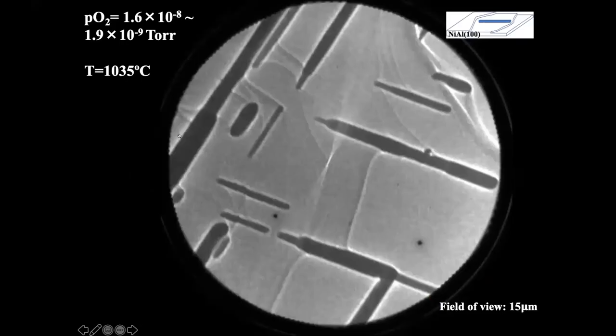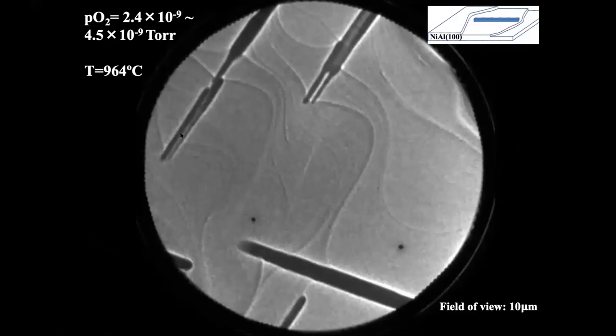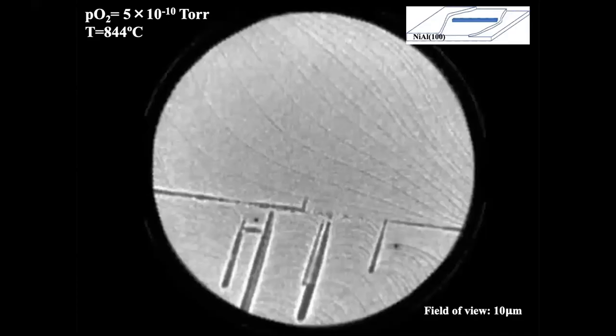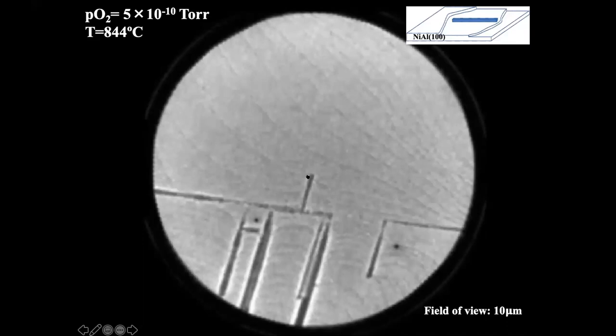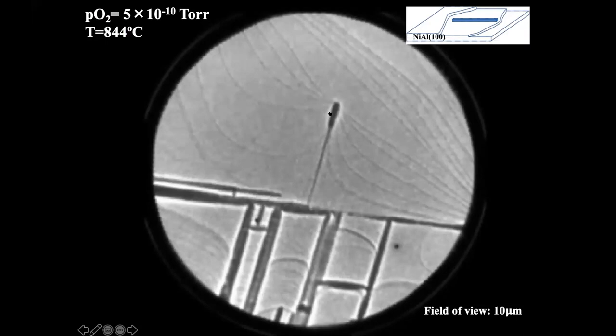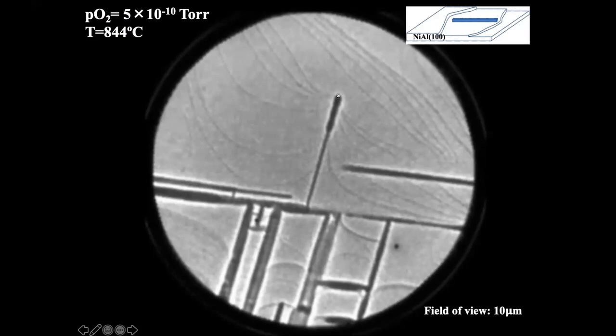And you can see a slow down process in this one as well. For example, for this oxide, we get more and more steps bunched in the growth front, then it slows down and eventually stops at this location. That can even make some backward growth. So basically it's caused by the number of atomic steps bunched in the growth front. Okay, I understand. Thank you very much.